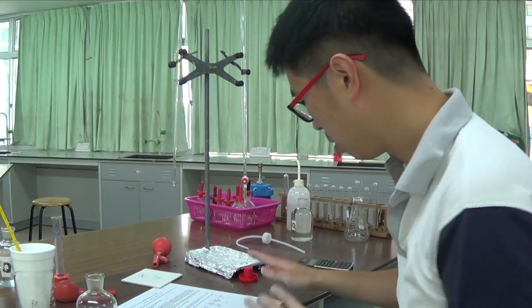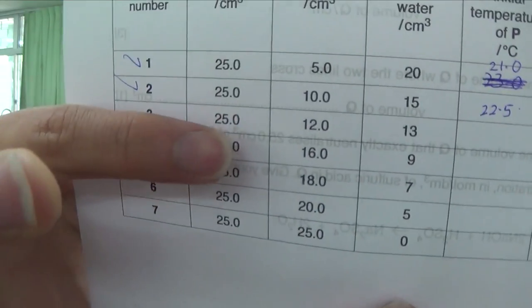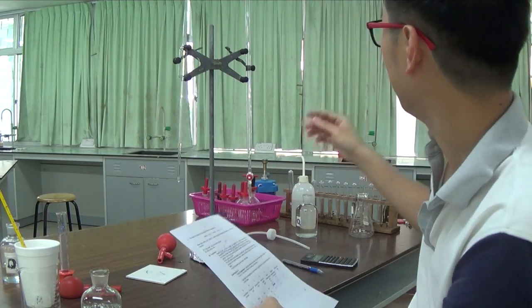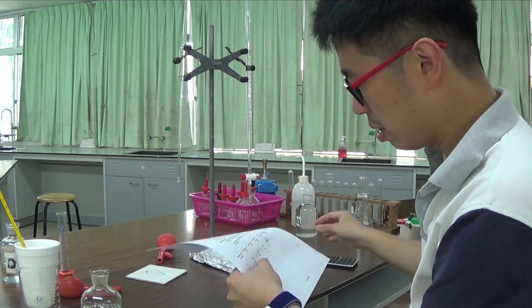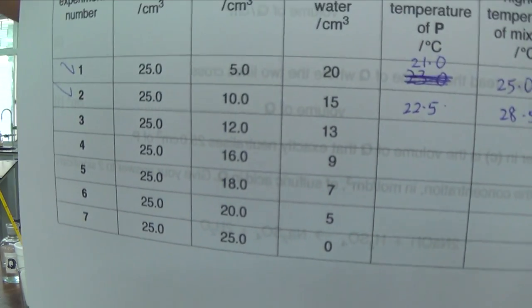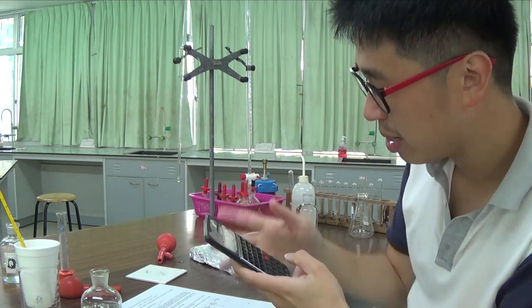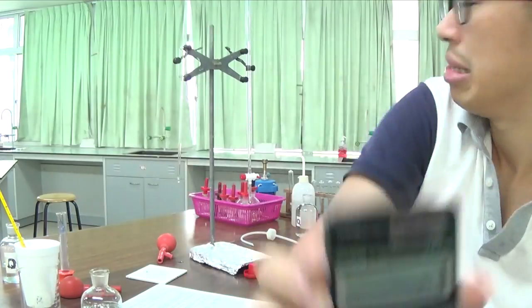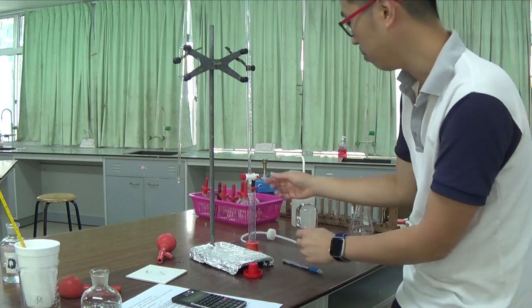Okay? So, what do I have now? Now it's very tricky. If you look at experiment 3, it is not 15, it is 12.0 cm³. Just now I have 5 and then I have 10. So now my reading on the burette is 15.00. So if I want 12.0 cm³ from the burette, and I start from 15.00, I need to take out 12.0 cm³. So I must stop at 27 here, and that will give me 12 cm³ in the measuring cylinder.